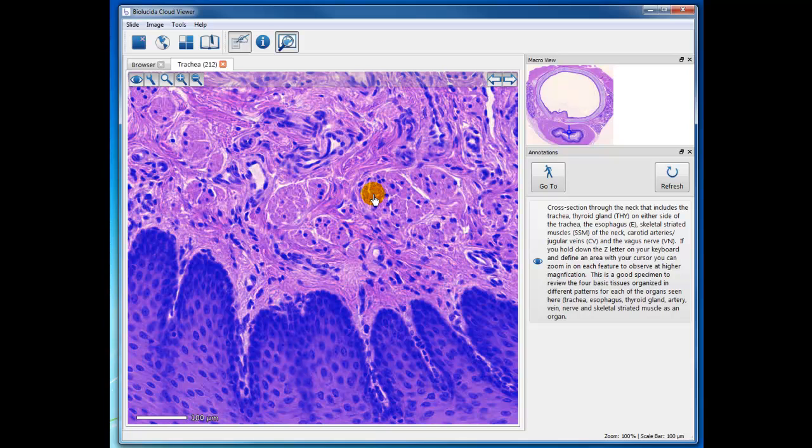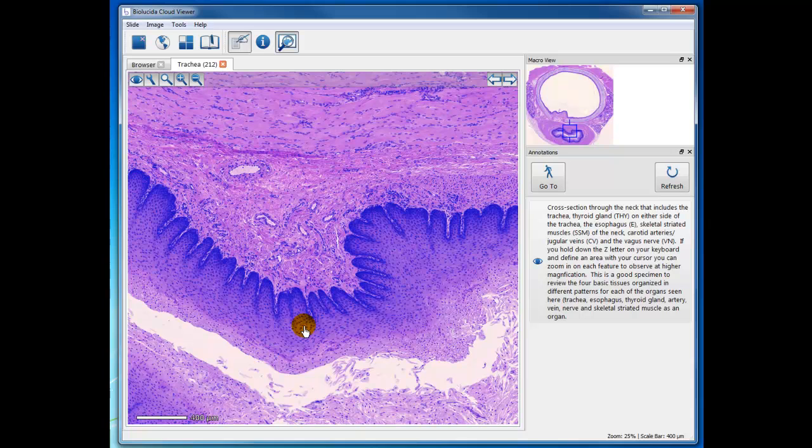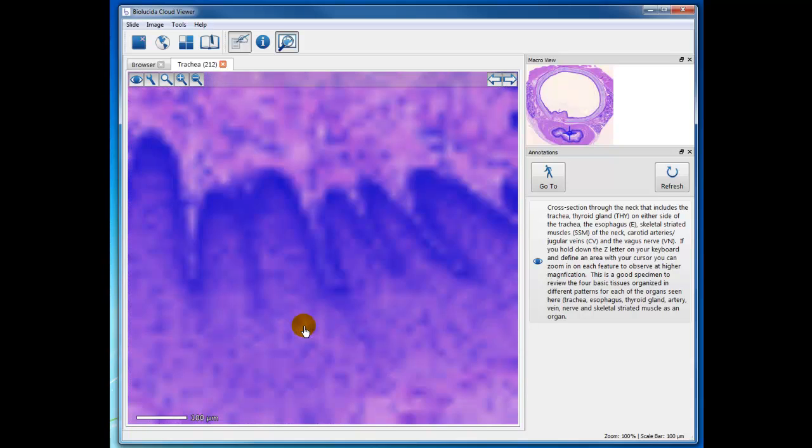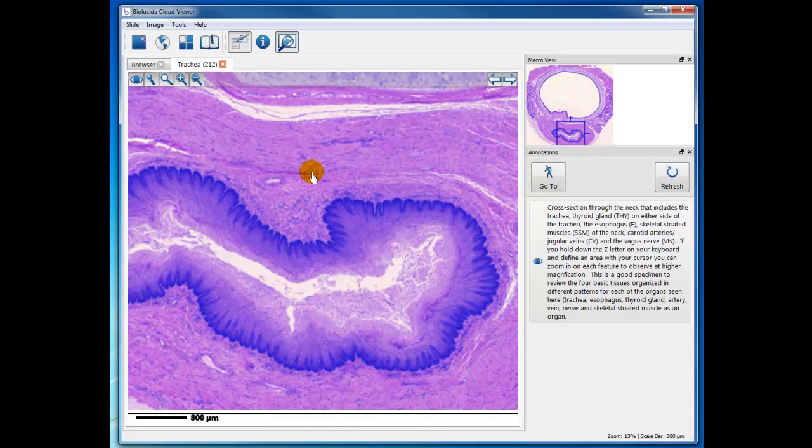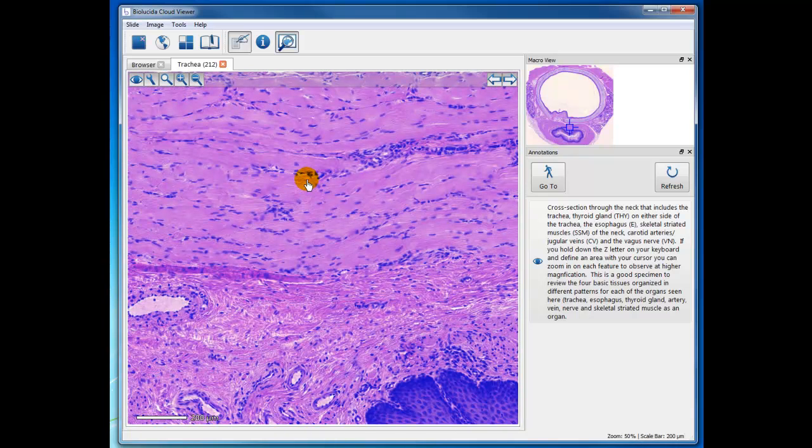Do you recognize that some of the profiles have nuclei in the center and others don't? That's very typical of cross-section of smooth muscle. So that's the muscularis mucosa. This is the lamina propria here, and of course the epithelium. And those 3 layers form the mucosa. And then underneath that, this is the submucosa, where you could find in some sections part of the length of the esophagus does have mucus glands, but they're not shown here. And then the outer layer can be composed of either purely smooth muscle or striated skeletal muscle, or a mixture of both, depending on the level.